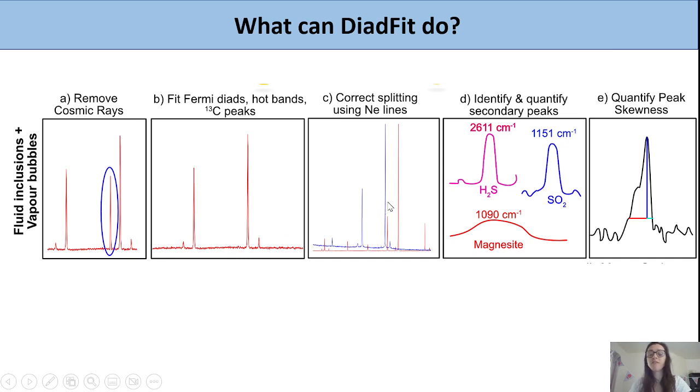Once you've removed that, you can fit various background positions and peak types to quantify the splitting between these dyads. There are different workflows. If you've measured the spectral emission of neon throughout your run, you can automatically loop through and fit all those neon lines.